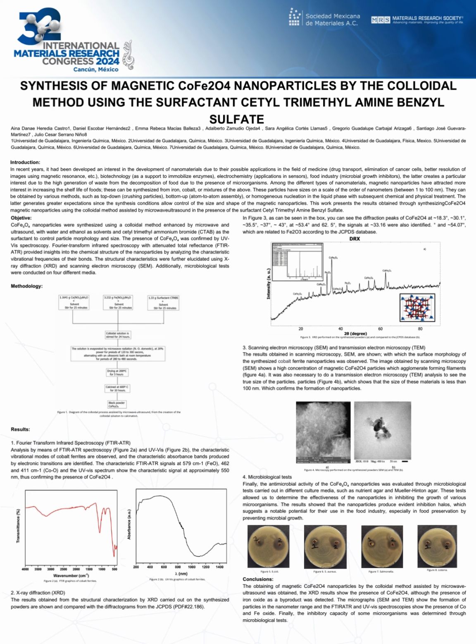Then the X-ray diffraction patterns show peaks corresponding to cobalt ferrite at approximately 18.3 degrees, 30.1 degrees, 35.5 degrees, and others, confirming the crystalline structure of the synthesized material.